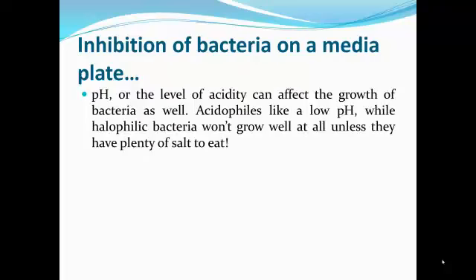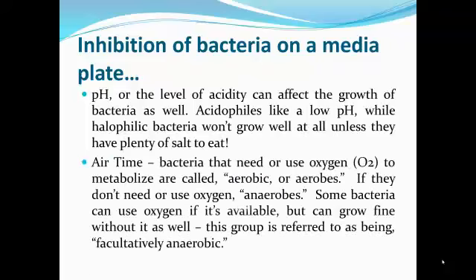Inhibition of bacteria on a media plate. pH, or the level of acidity, can affect the growth of bacteria as well. Acidophiles like a low pH, while halophilic bacteria won't grow well at all unless they have plenty of salt to eat. Don't want to check their blood pressure.